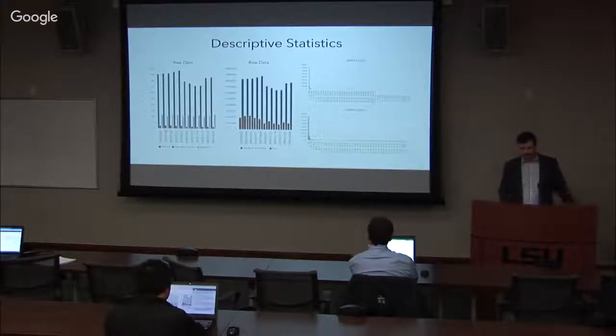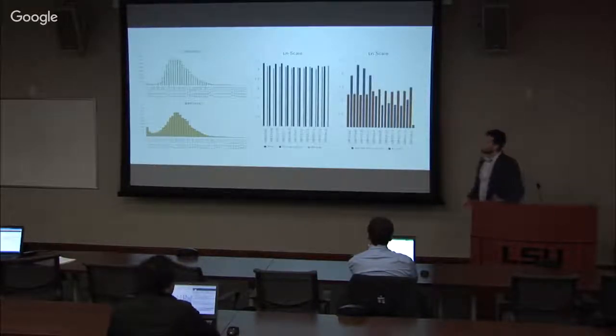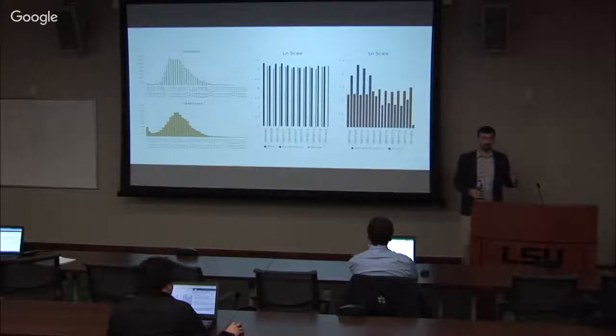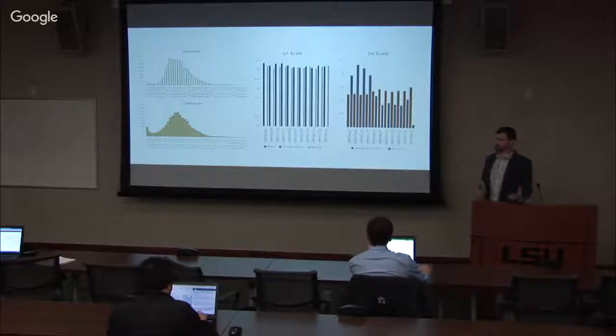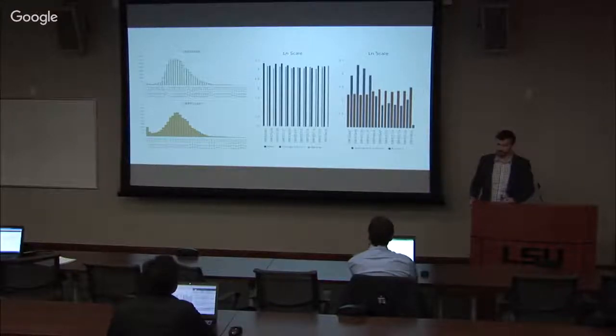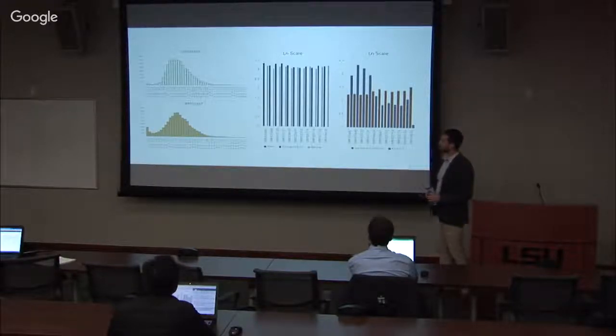Now let's take a look at the same descriptive statistics, but for logarithm scale. And so you can see now that everything is more stretched out. Compare this to seeing something under the light or outside of the light, right? If you are trying to compare colors and it's dark, it's not as easy to differentiate between dark red and dark green, right? But if you have bright light, then you can see much better what the difference is. And that is what this really allows you to do.